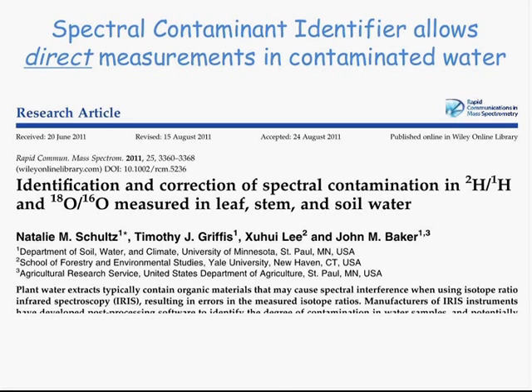Then one question from James Farland. How long does it take to switch the system from liquid water to water vapor? Are there any problems with a memory effect when switching between the two operational modes? Thanks. I'm sorry that I didn't mention that.